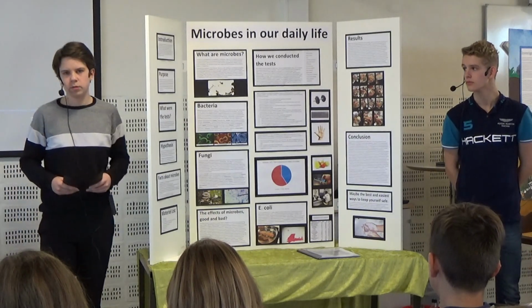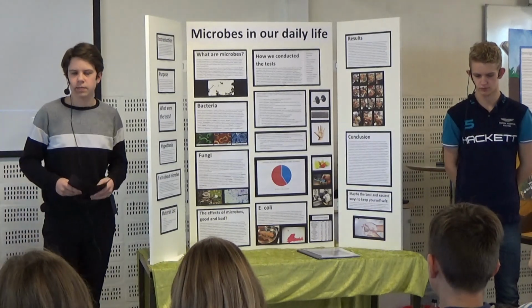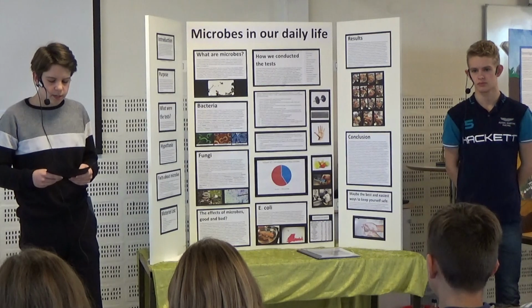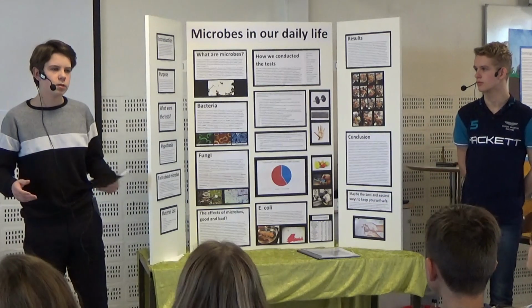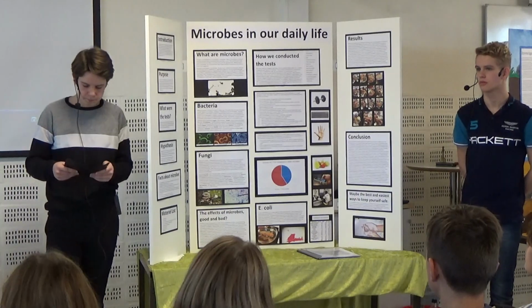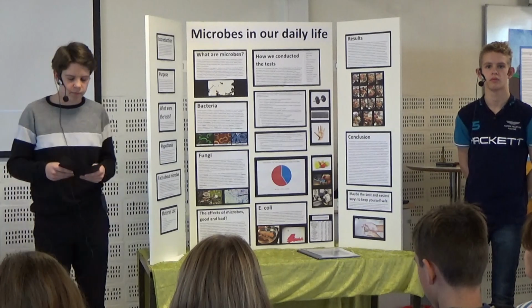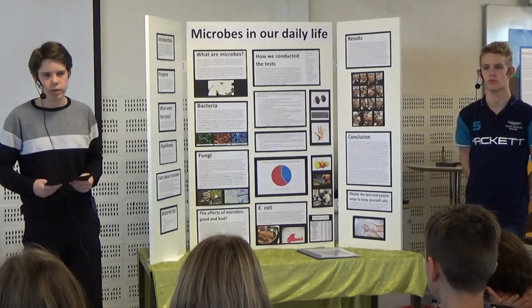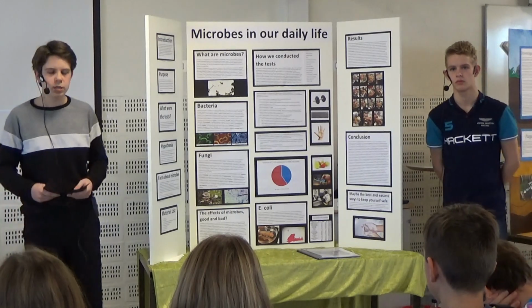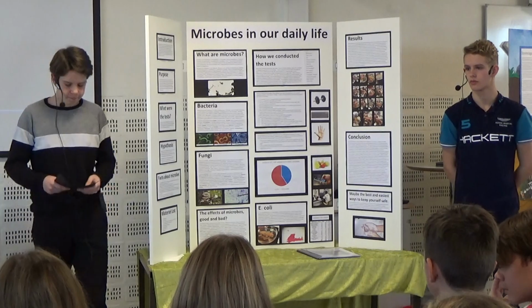Only 8 small colonies grew on that sample. That is the cleanest one except for the control. And that is incredible compared to how disgusting sweat is and how much sweat we expose every day. The area that we sampled is an area of the machine that is nearly impossible to miss, so we would be sure to get the right result, and we got the results that we hoped for. The cleaning of the machine does actually clean it.